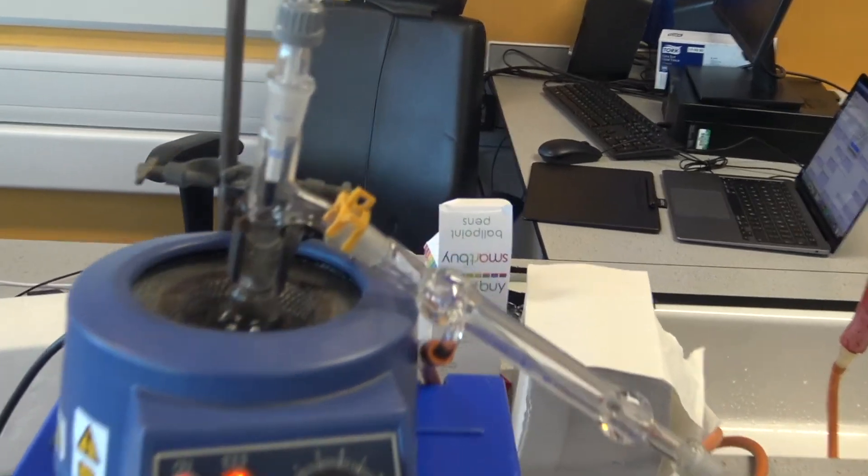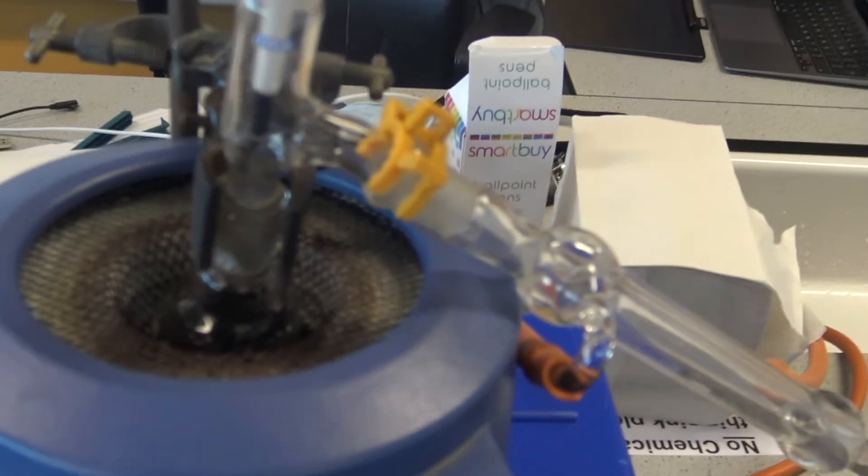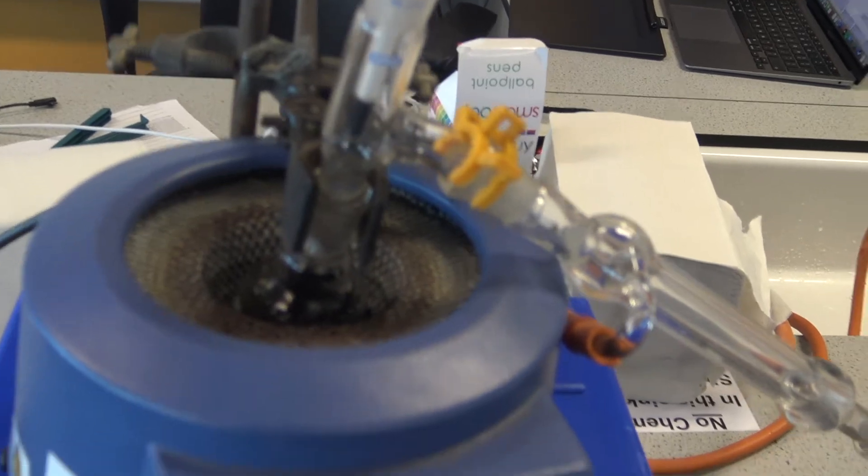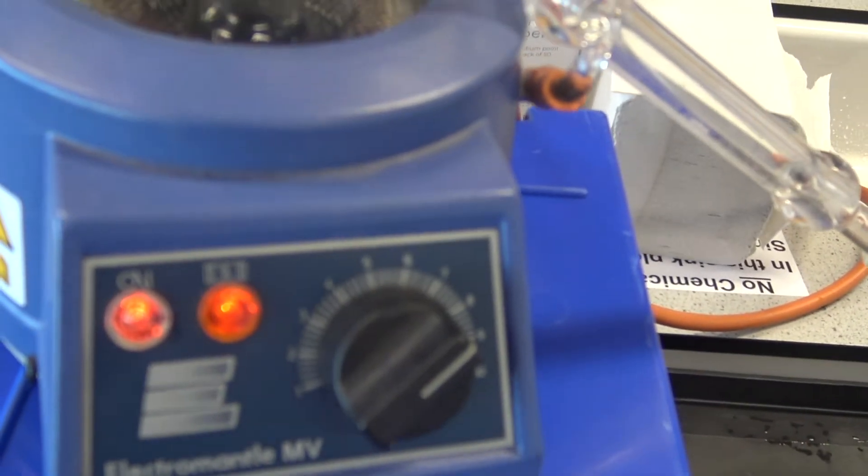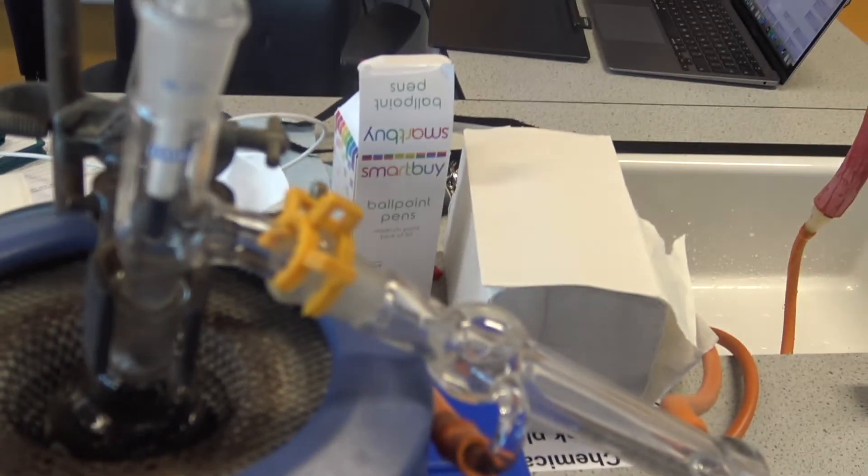So here I have the distillation setup, and I'm using a round bottom flask which is sitting inside. This is a heater that's heating up the mixture I've got inside here, which is actually ink and water.